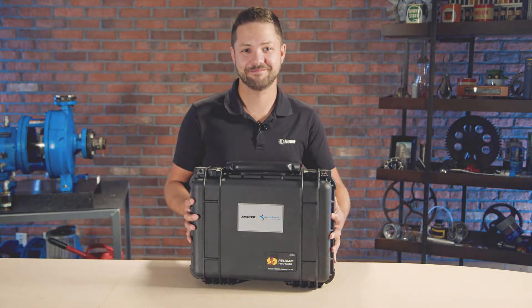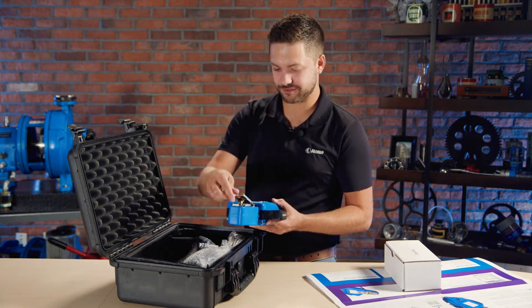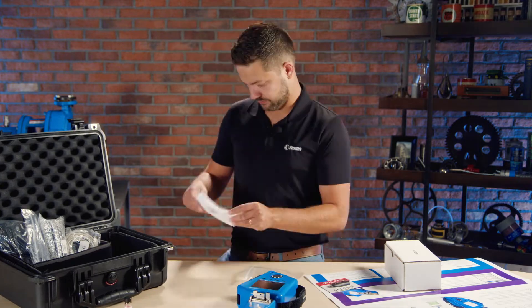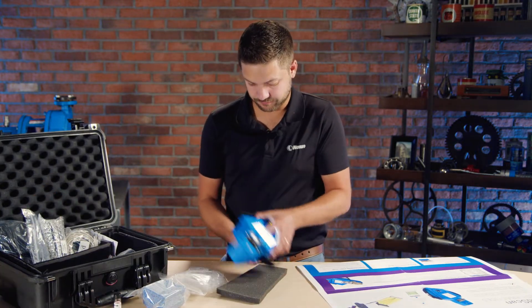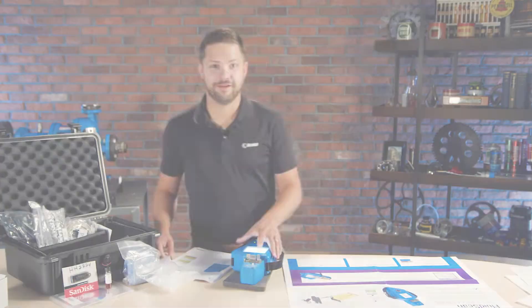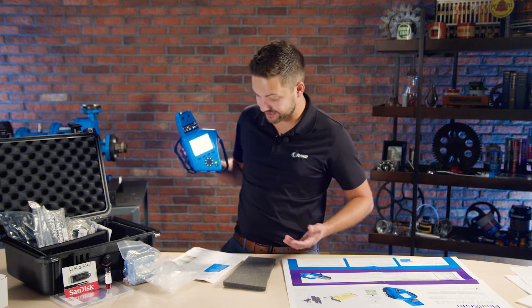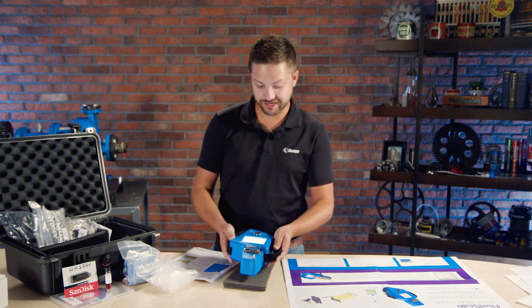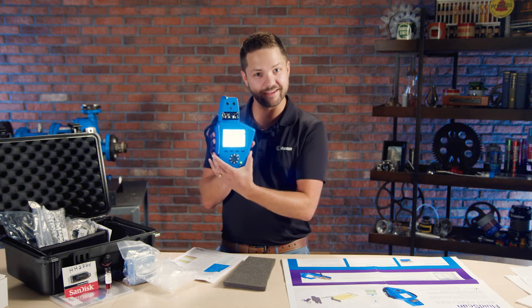Hey guys, Bennett Fitch here and welcome to another Noria unboxing. Today we have the SpectroScientific FluidScan 1100 series. It's a really cool technology because it's an infrared spectrometer in a handheld device.